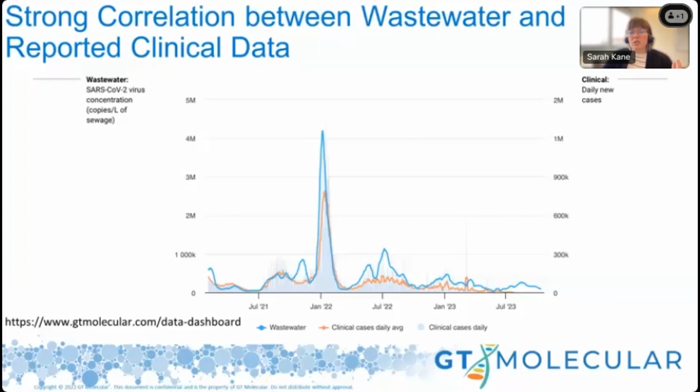And the question is about optimizing assays to eliminate rain. There are always some tips and tricks and tweaks that we do within the R&D context in order to do so. Specifically, if you are trying to eliminate rain, the easiest and most straightforward approach that we've taken is to increase your cycle number. It cleans up the rain, takes any of those intermediate droplets and forces them to be a little bit higher on the fluorescent amplitude axis. So that's a first thought that I have for eliminating rain. And again, Kyle, if you'd like to jump on a call, more than happy to.